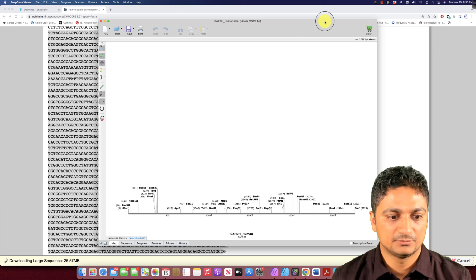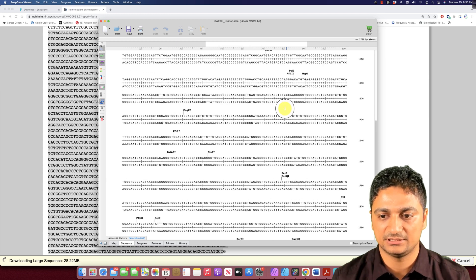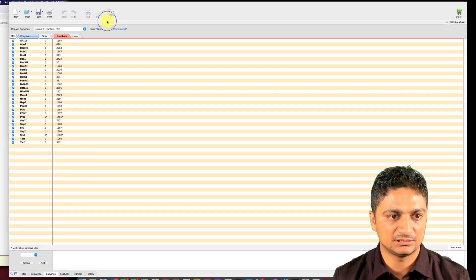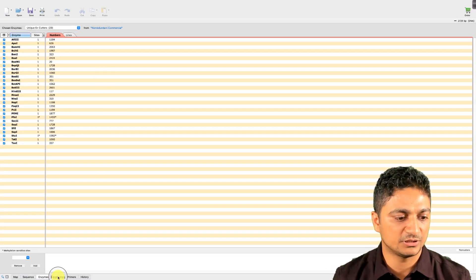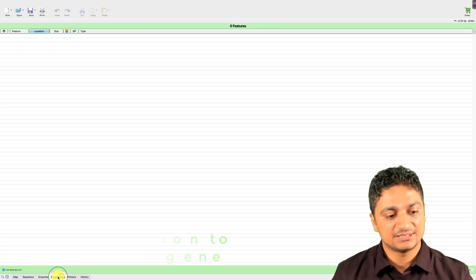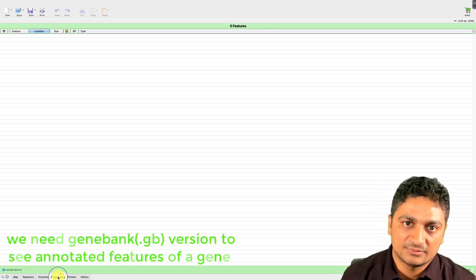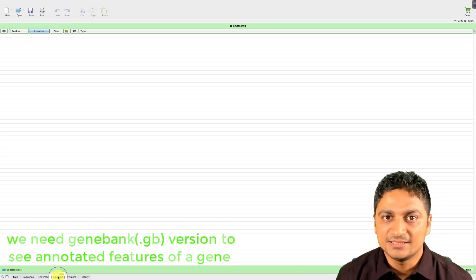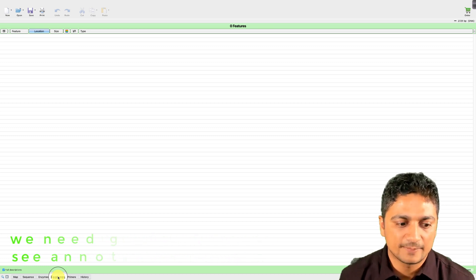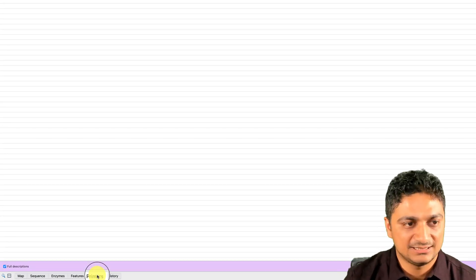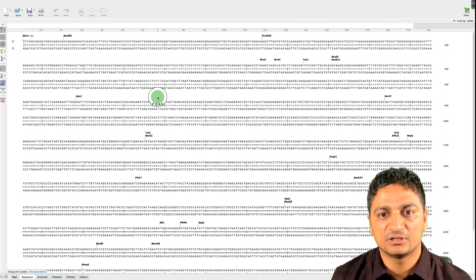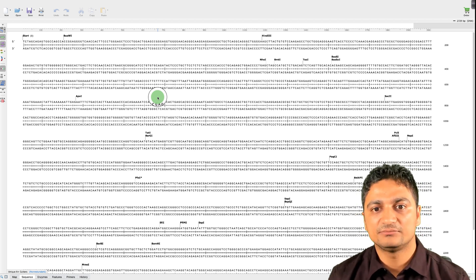Now this is the DNA sequence we have. If you want to see it in map view or sequence view, you can see all the sequence right here. We can design primers and look for different restriction enzymes we can use for cutting. However, since this is a FASTA version, we don't see any annotated features. If you want to see the features of a gene, you have to download the GenBank version from NCBI. Primer viewing may require the paid version.